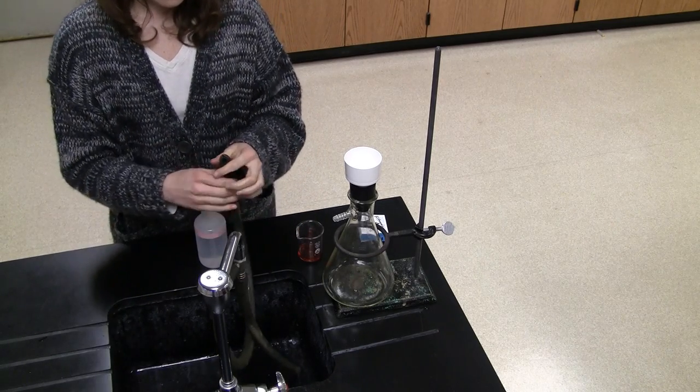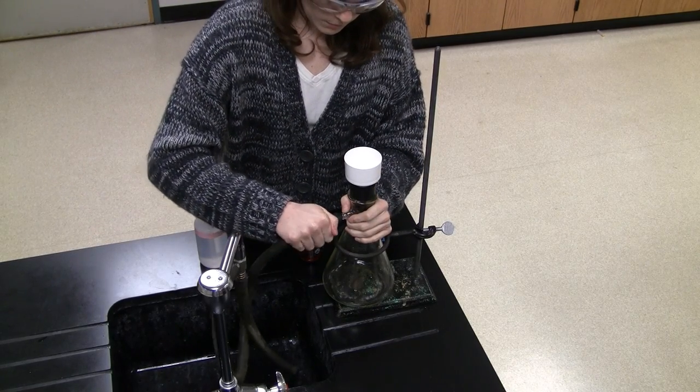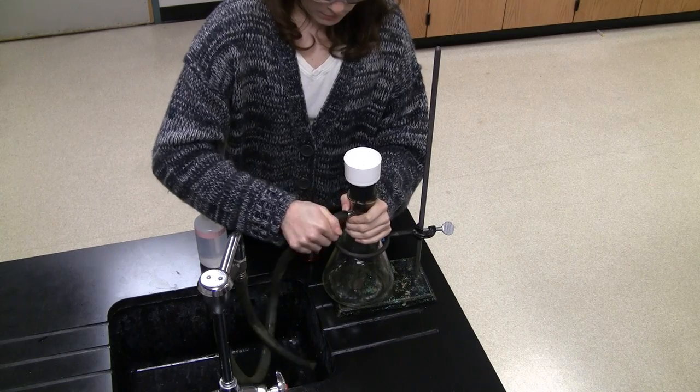Connect this hose to the side arm of the filtration flask. The suction aids in pulling the liquid through the filter paper in the Buchner funnel.